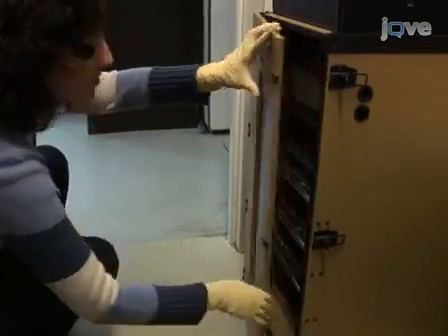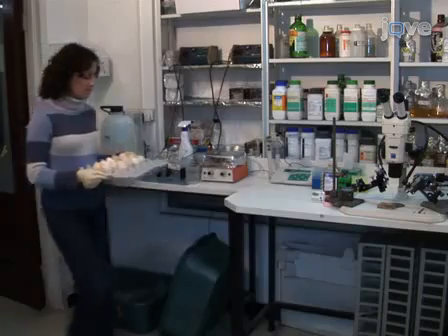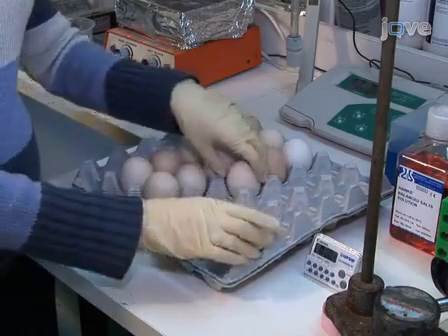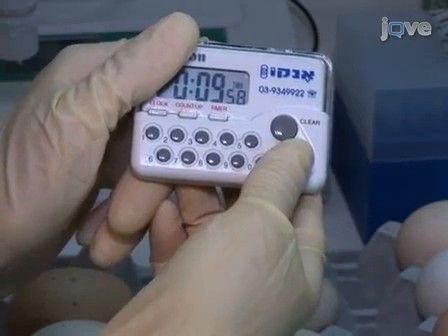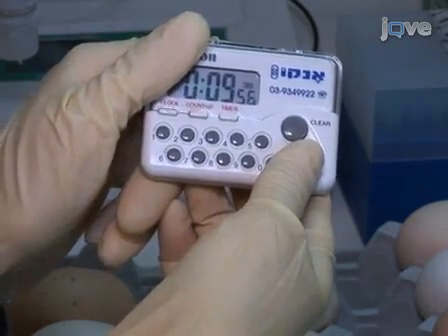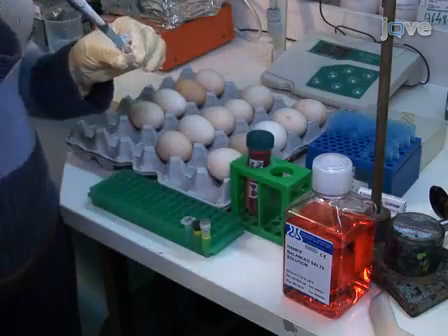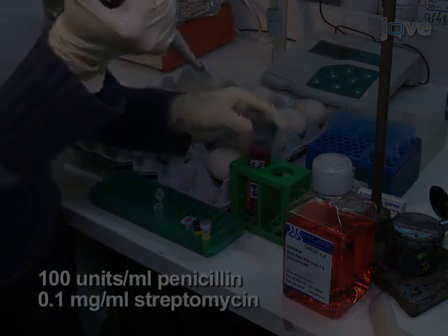The chick embryos reach HH stage 19 to 20 after 66 hours of incubation, and at that time remove the eggs from the incubator. After removing the eggs, place them horizontally and wait for 5 to 10 minutes. The embryo is now located at the upper pole of the egg. Prior to electroporating the embryos, prepare Hank's solution with 100 units per milliliter of penicillin and 0.1 milligrams per milliliter.